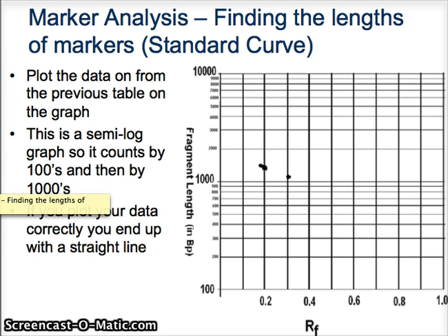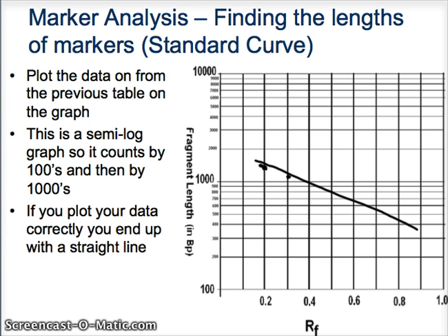All right, and then it should keep going, and eventually you should get pretty much a straight line. That's what your standard curve should look like if you did all your measurements right. So now you put that to the side, and we'll come back to that. We made that standard curve.